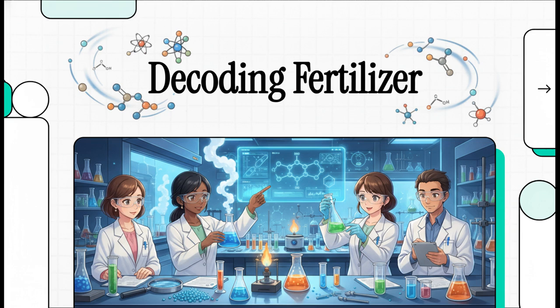If you've ever found yourself wondering how we actually know what's inside the fertilizers that literally feed our planet, well, you are in exactly the right place. We are going to explore the precise, step-by-step procedures a chemist follows to figure out the exact amount of available phosphate in solid fertilizers. It's a process that requires some incredible precision, some really fascinating chemical reactions, and a little bit of clever math. So let's just dive right into this.